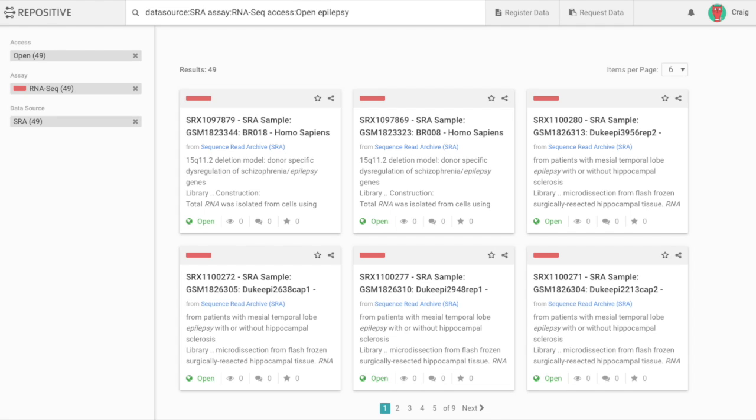Okay, so now, as you can see here at the top, we've performed that series of filters that basically are matching the metadata, that is the description that the scientists that deposited those data sets have used. And this is the open data, so the public data that is accessible through the repositories where these data sets are held.